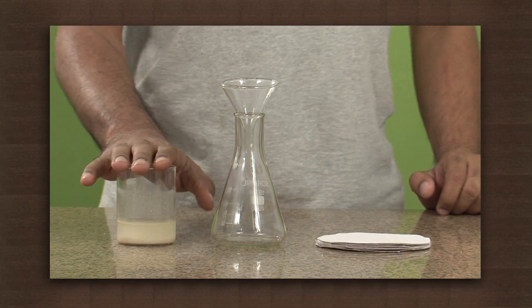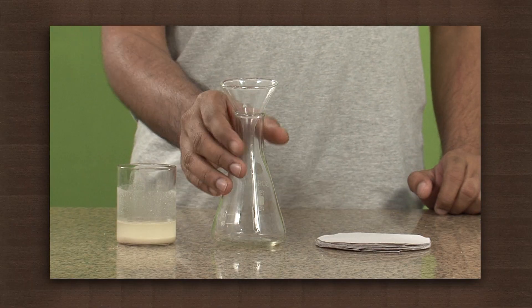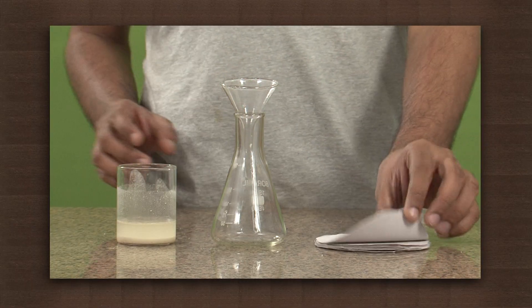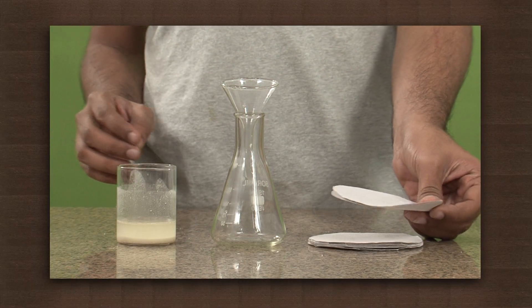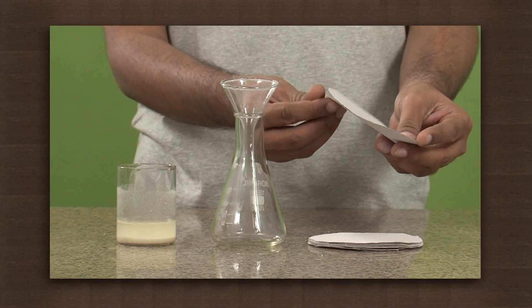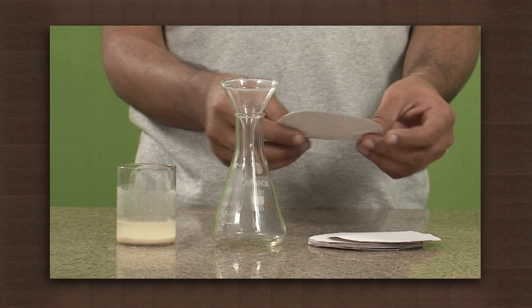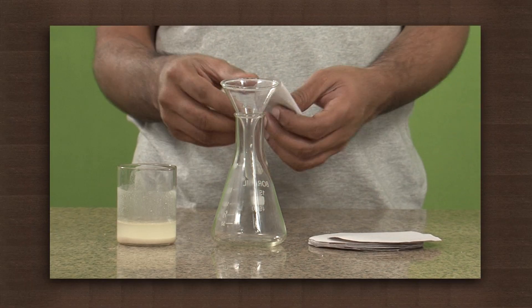We need a mixture of wheat flour and water, a conical flask, a funnel, and a filter paper. Fold the filter paper in the form of a cone and fix it on the funnel.